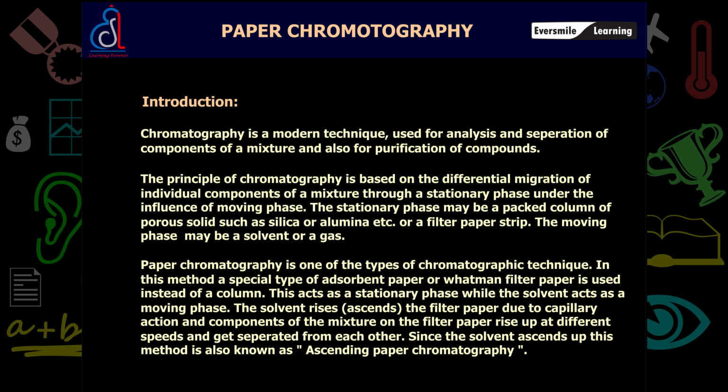Introduction. Chromatography is a modern technique used for analysis and separation of components of a mixture and also for purification of compounds. The principle of chromatography is based on the differential migration of individual compounds of a mixture through a stationary phase under the influence of moving phase.